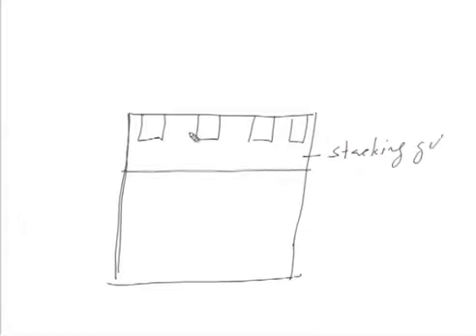All right. So, let me show you on the screen what the situation is here. On this gel you have two gels actually. This is the stacking gel, this is the resolving gel. So, when you are casting the gel, first you have to pour the resolving gel, and then after the resolving gel is polymerized, you put the stacking gel.